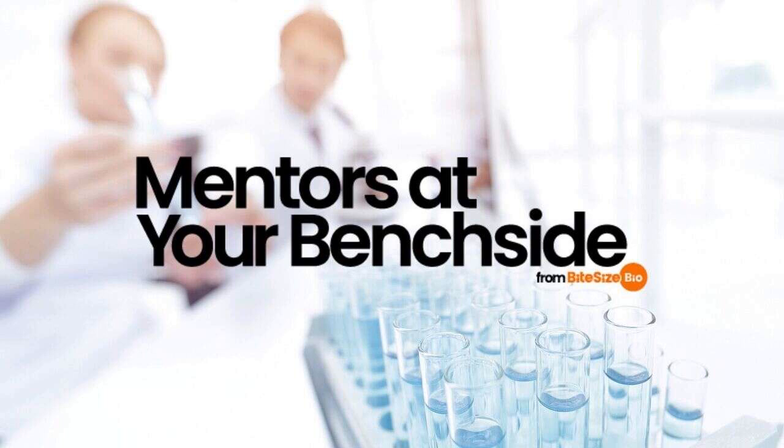And remember, always keep a detailed record to ensure consistent performance, as any variation will alter the reproducibility of your staining. It sounds obvious, but immunofluorescence staining is a long process with many steps. It's crucial to optimize every step of the protocol before you decide to generate data from your sample material. So that's it for immunofluorescence controls and what they do.